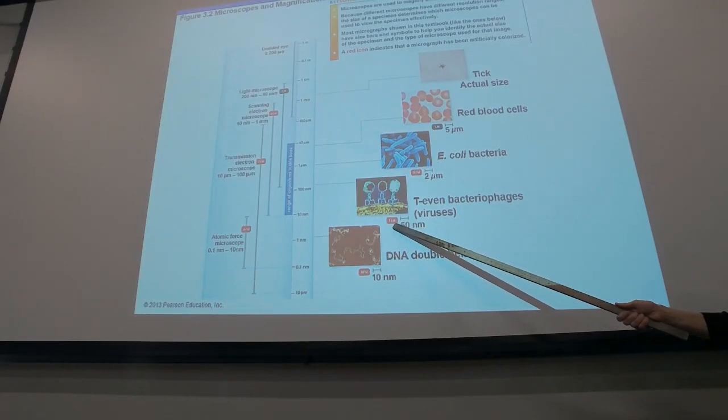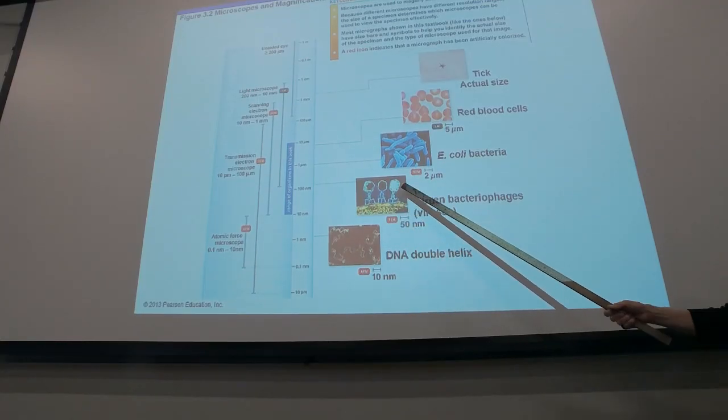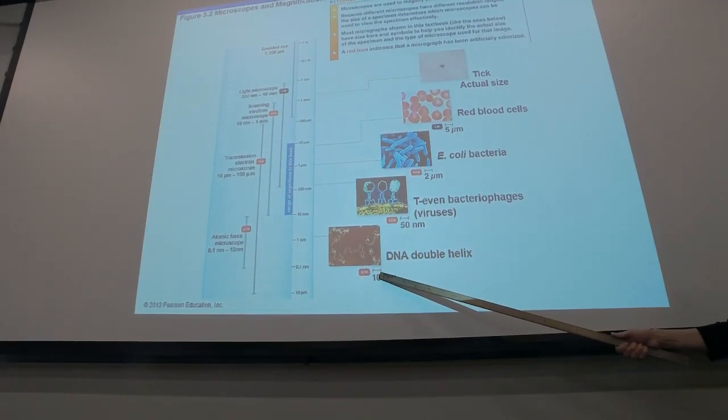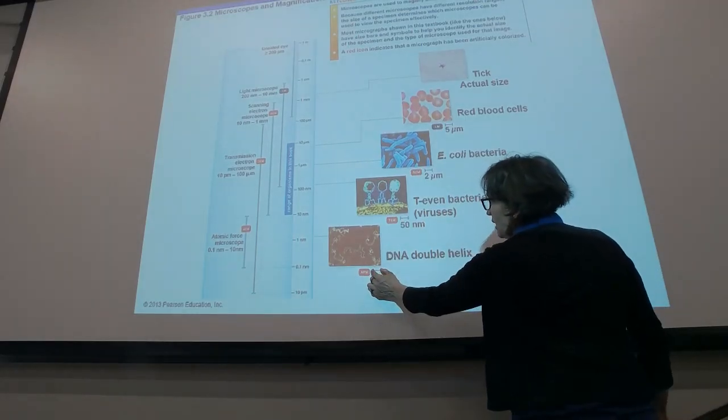And then these viruses, which are DNA viruses, you can observe the DNA with atomic force microscope, or AFM. And in this case, the bar scale is 10.